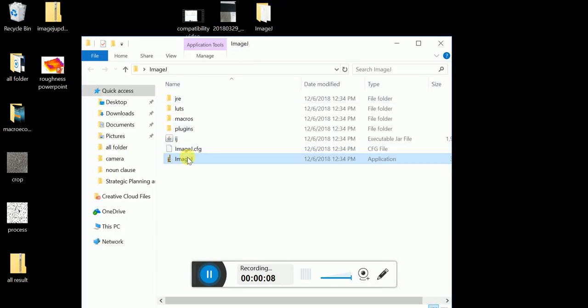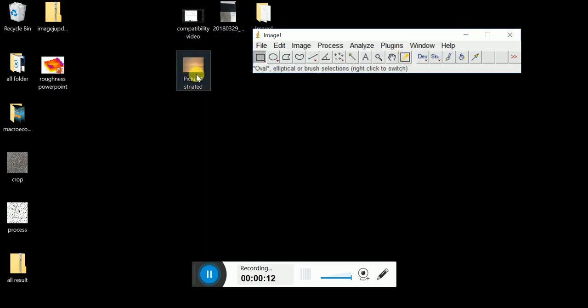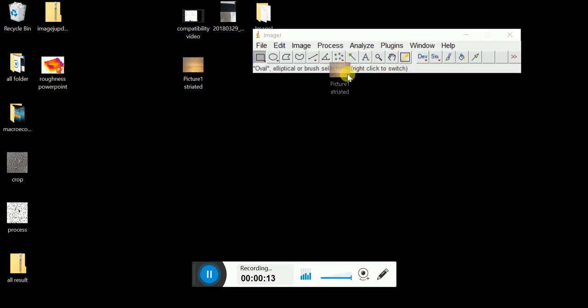Open ImageJ, a toolbar popup. Drag the picture you analyze to the toolbar.